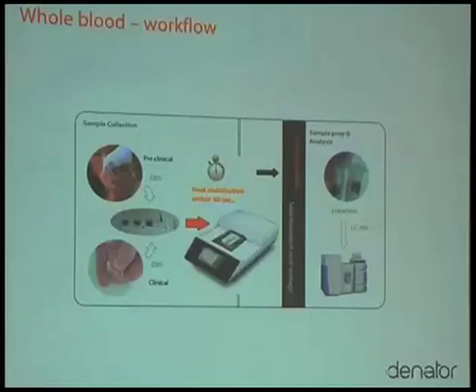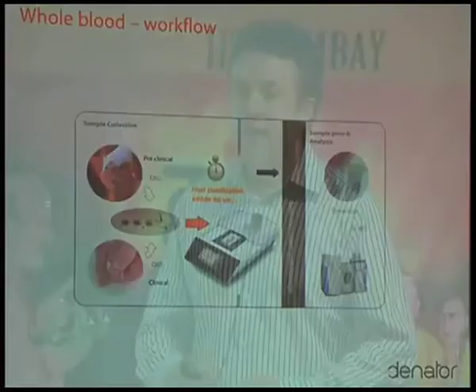We've analyzed, together with a group in Thailand, a number of pharmaceutical compounds. They want to do DMPK studies: how quickly is a pharmaceutical that you take metabolized in the body. Very many pharmaceutical compounds are metabolized differently between different people.